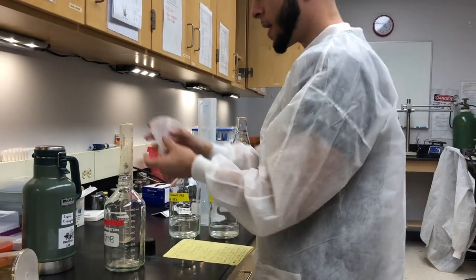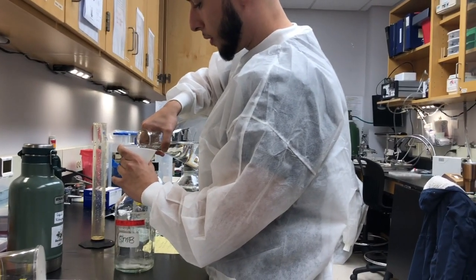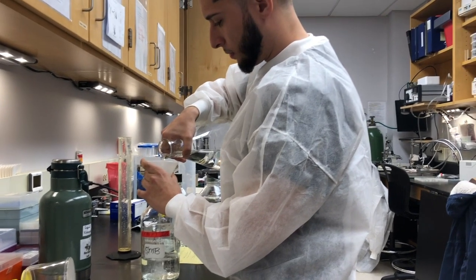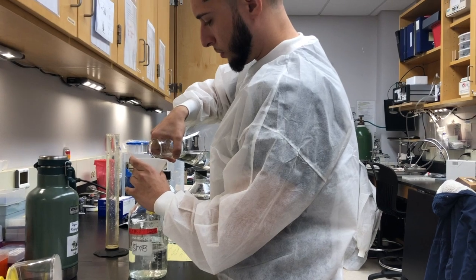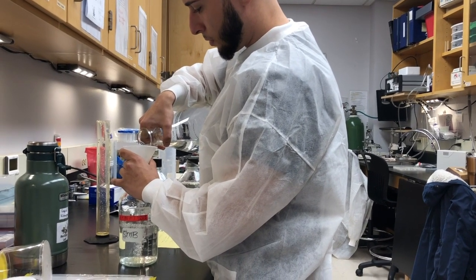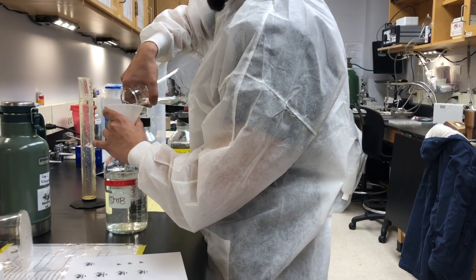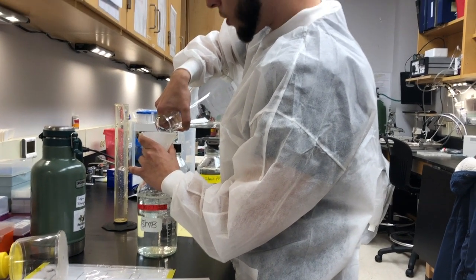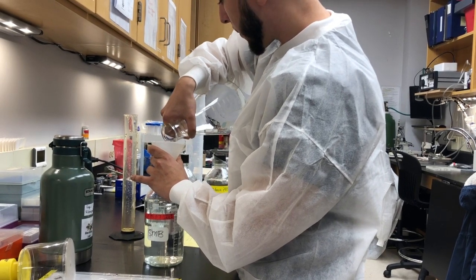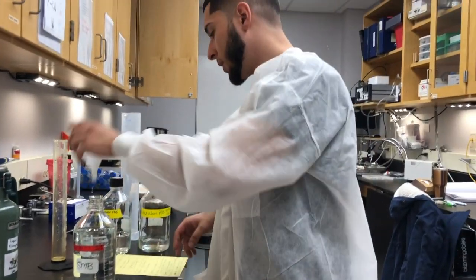Now you're just going to want to get a funnel to avoid any mess. Make sure you don't overpour so you don't overflow the funnel and make a mess — we are anti-mess in this lab. And just like that, we made one liter of PBS.